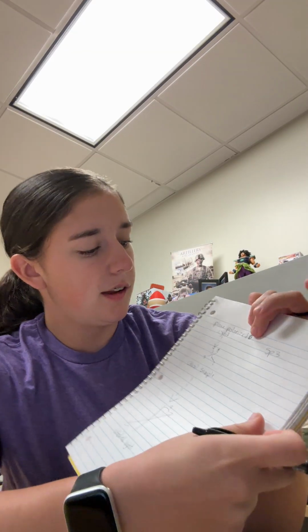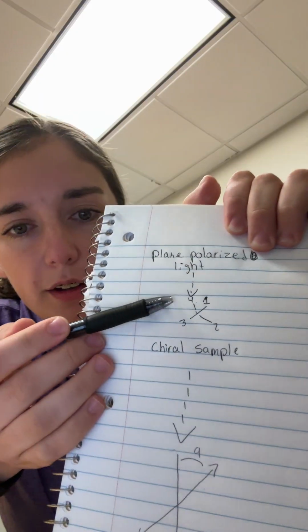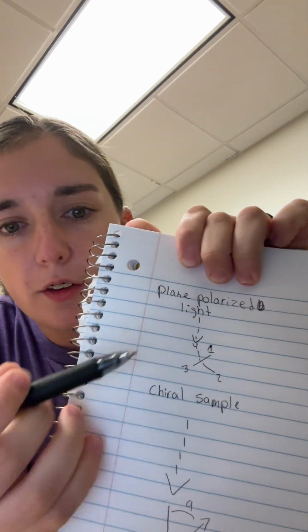So the phenomenon that was measured in this lab was the optical activity. This occurs because the chiral molecules contain an sp3 hybridized carbon, and it's bonded to 4 different groups. So just an example here. So it's asymmetrical. It's kind of hard to tell from my drawing here. It makes the molecule non-superimposable on its mirror image.